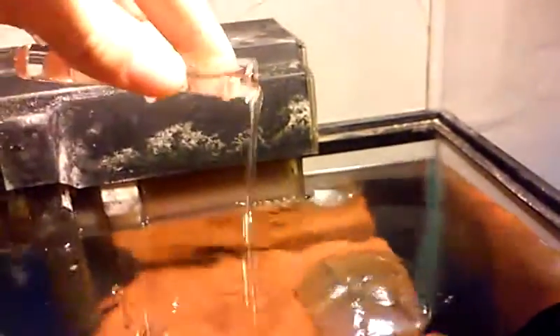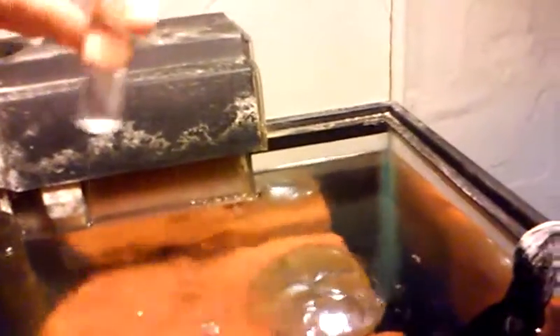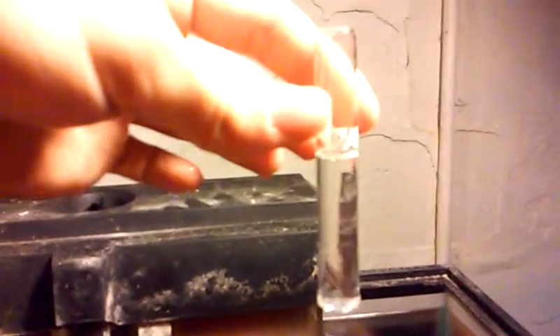First, take your test tube, rinse it out in your aquarium a few times, and then fill it up pretty close to the line. For ammonia, there are two different bottles. First you're going to put eight drops of bottle number one.